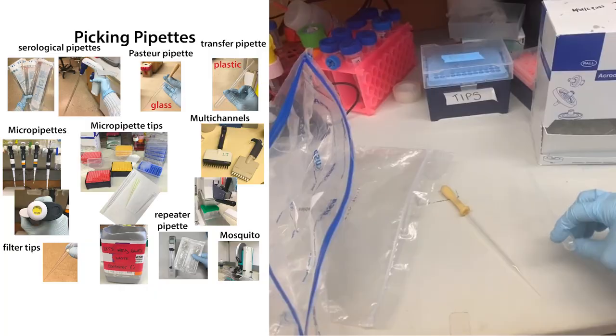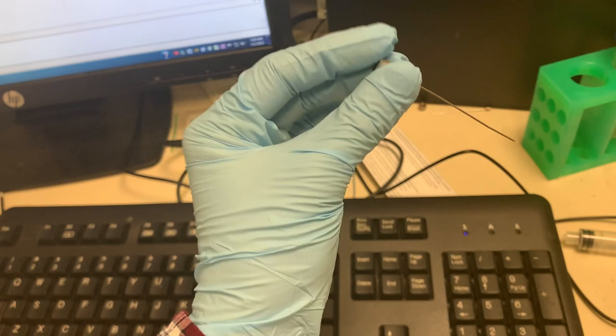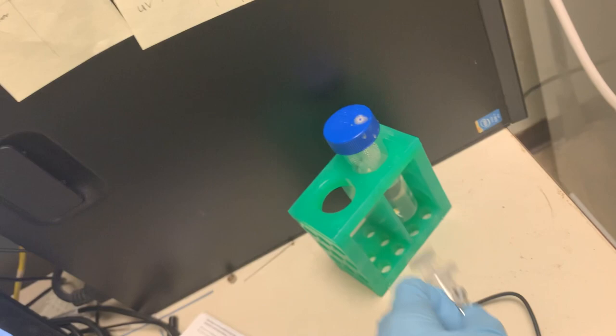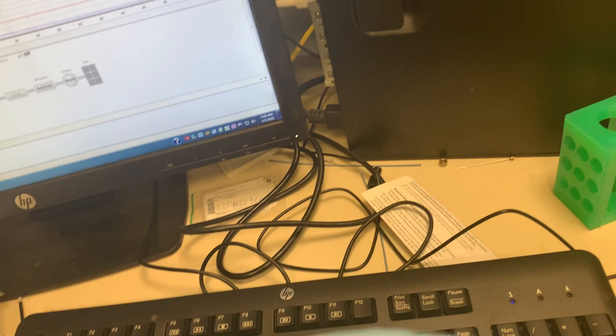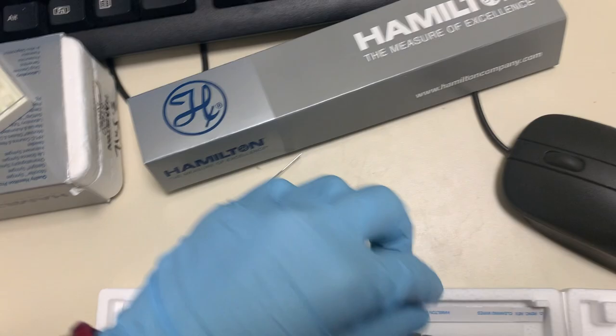These are Hamilton syringes — glass syringes really helpful for injecting into an AKTA for size exclusion chromatography. We have a bunch of different sizes: 100 microliters, 250, 500, 2.5, and some bigger ones where you have to put the needle onto the end. You can also put these needles onto plastic luer-lock syringes. These needles aren't as sharp and are reusable — they're metal. It's important to wash them afterwards by squirting water through so nothing gets clogged. They also come with little cleaning wires if something does get stuck.